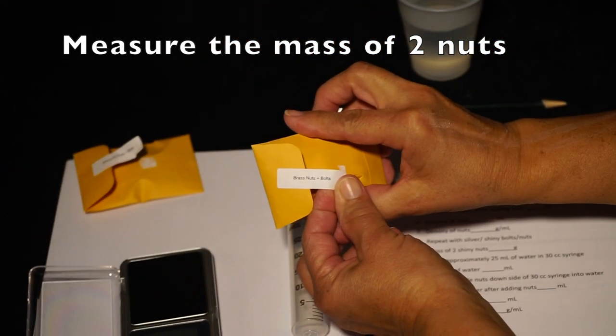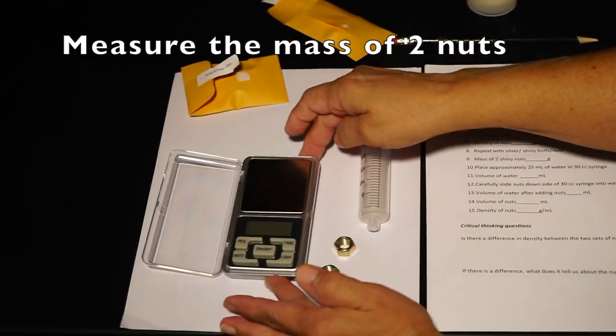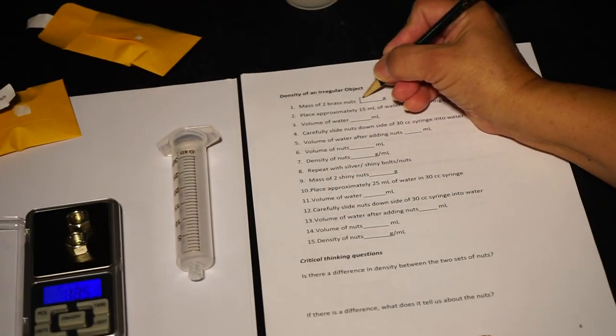Density of an irregular object: First measure the mass of two of the nuts by using your balance. Record this in your data table.